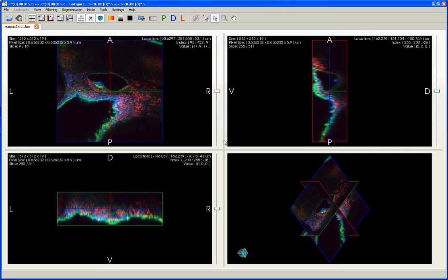In this tutorial, I'll show you how to visualize and navigate through 2D and 3D images using the GoFigure software.